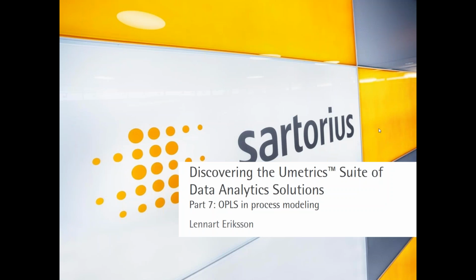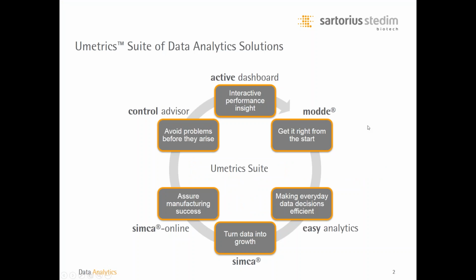For those of you that have not attended this series of webinars in the past, we have here a little overview of the different components or elements making up the Umetrics suite of data analytics solutions. In the beginning of this webinar series, we started out by looking at the MODDE software for design of experiments and quality by design to get things right from the start. We have also covered the EasyAnalytics solution to help you make everyday data decisions efficient.